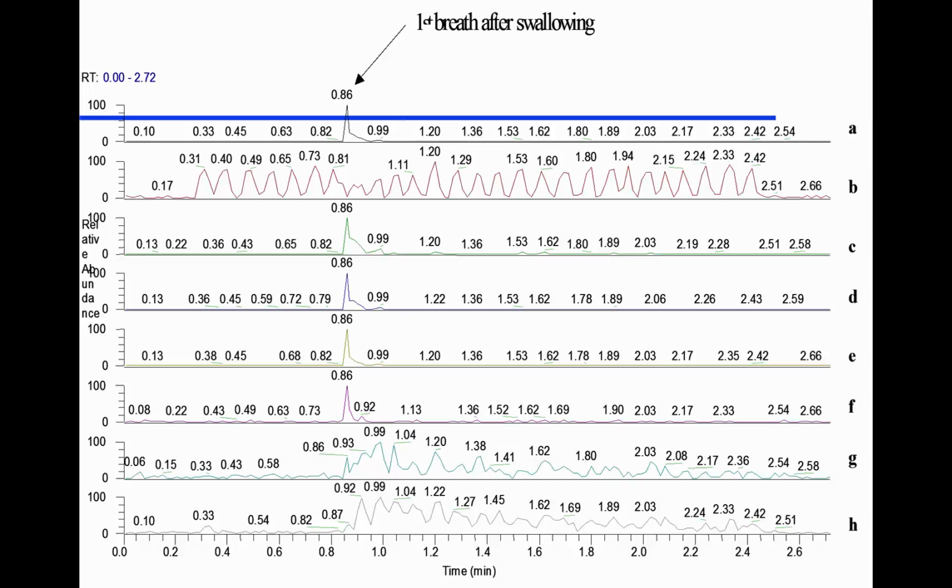So there's nothing here because he was inhaling, so you're drawing air in. There's no acetone then, unless it's in the room. Then he exhales, and so from your lungs comes the acetone. Then, of course, he's inhaling again, exhale, inhale, exhale. So essentially, the mass spectrometer is taking track of this breathing profile, and that's kind of a reference. And so this is then looking for different flavor compounds that happen to be present in the food.